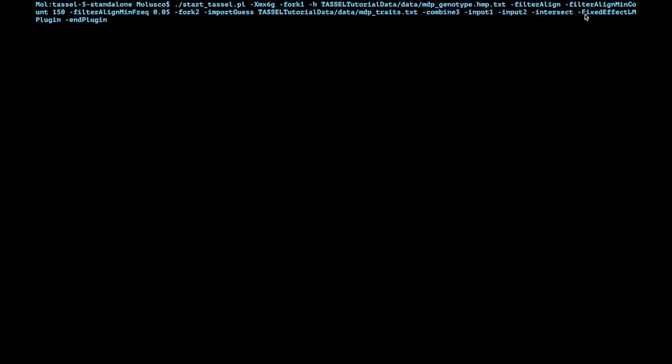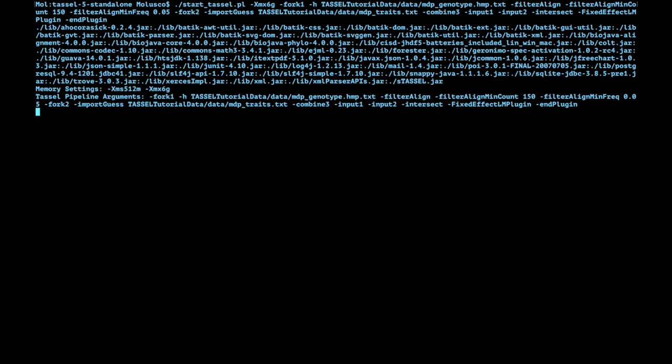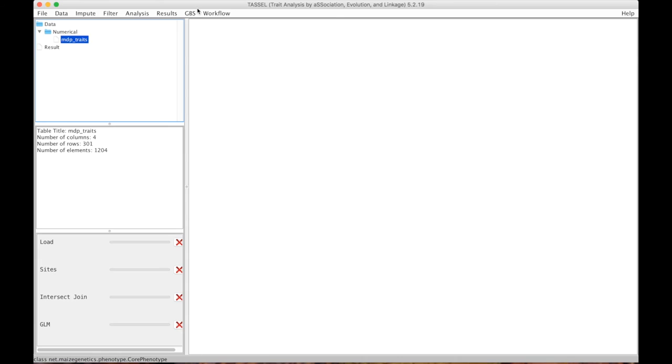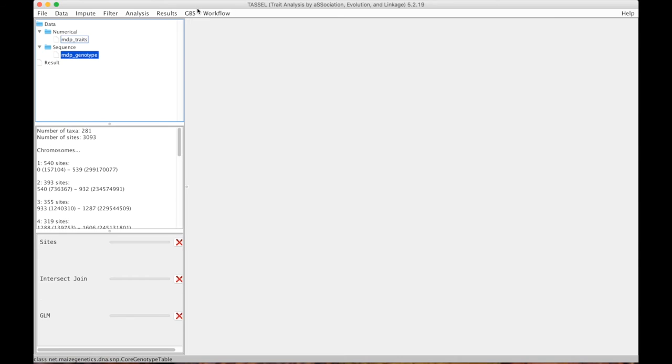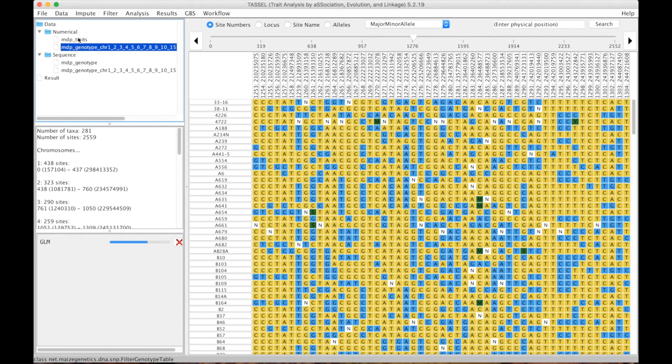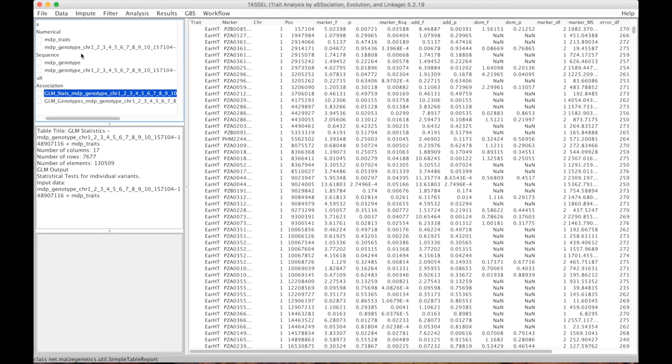As I mentioned, we start this command with start_tassel.pl. So when I hit enter and run, it takes me to a new screen and then it launches the user interface. It loads the genotypes, the phenotypes, it filters the genotypes and now we have the results for the association. It all happens very fast, this is the simplest model, it's very fast. So I always suggest running it first.